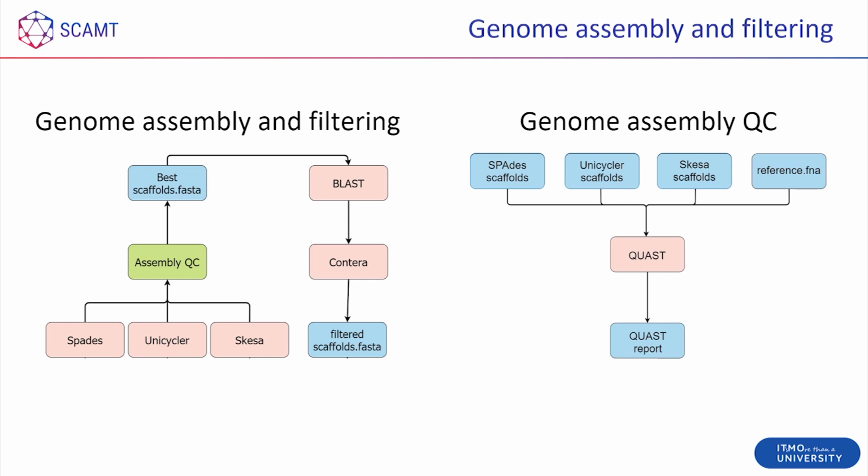Filtration goes with the help of our own Conterra tool. It parses BLAST analysis of the assembly, looks for contamination, and removes it if any. In addition, it determines the closest reference taxon ID and downloads the reference assembly and annotation.